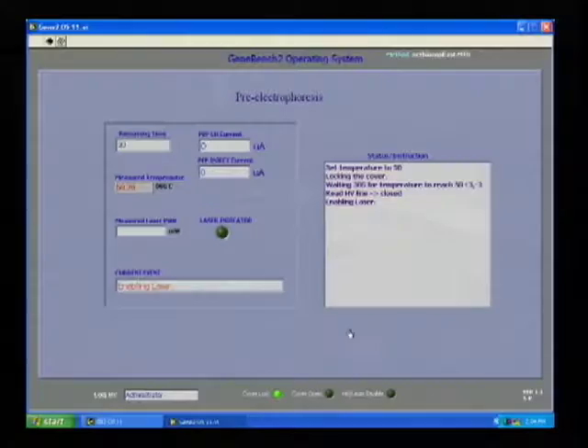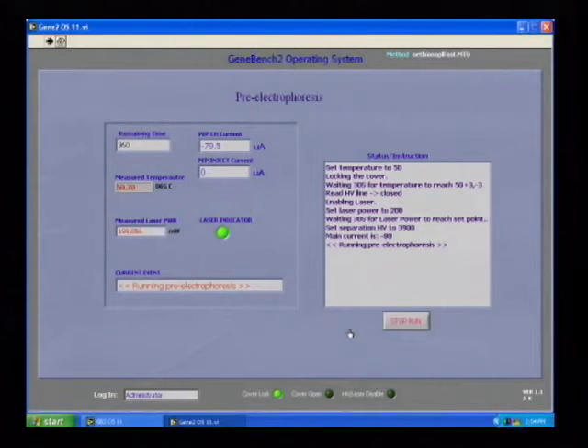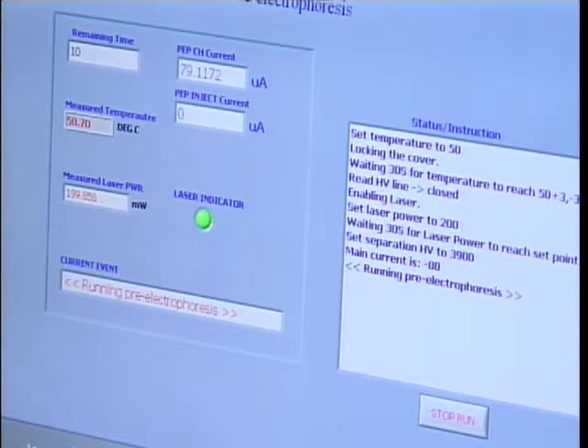The system from this point on will take control. The first thing it does is pre-electrophoresis, which essentially cleans the separation channels of unwanted ions prior to loading the sample. At the conclusion of pre-electrophoresis, ions within all 16 separation channels have been removed, and the channels are ready for separating the PCR product loaded into the sample wells.